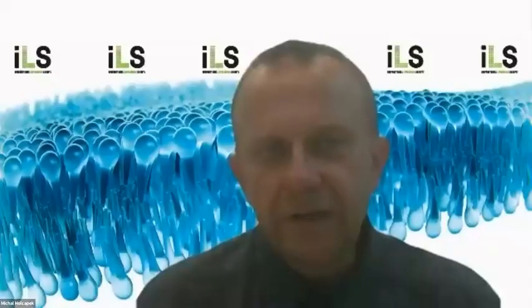The very first is very technical. At the beginning, you showed how complementary direct phase chromatography, like HILIC for example, and reverse phase chromatography are. I was wondering if you ever played around with 2D chromatography using these two phases, first dimension with HILIC and the second reverse phase. I ask because we did something in our lab in the past, but we never really came up with something robust. Yes, we have published a couple of papers on this.